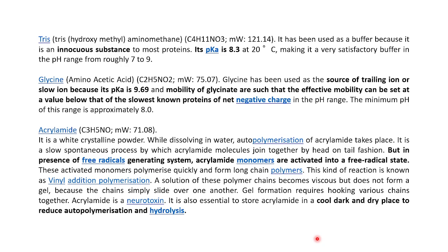So in the stacking gel, the glycine is in a neutral charge because it's at pH 6.8. At that particular pH, glycine would be in a zwitterionic form. The other ion that plays a role is the chloride ion. That's the smallest ion with the highest amount of charge, so its mobility will be very fast. So chloride moves the fastest.